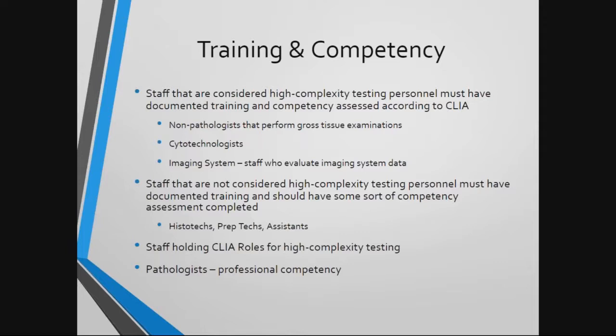So training and competency is the first topic we will discuss. Documentation for both training and competency should be available for every employee. This is particularly true for staff that are considered high complexity testing personnel, including non-pathologists that perform gross tissue examinations, cytotechnologists, and then any staff who evaluate imaging systems.